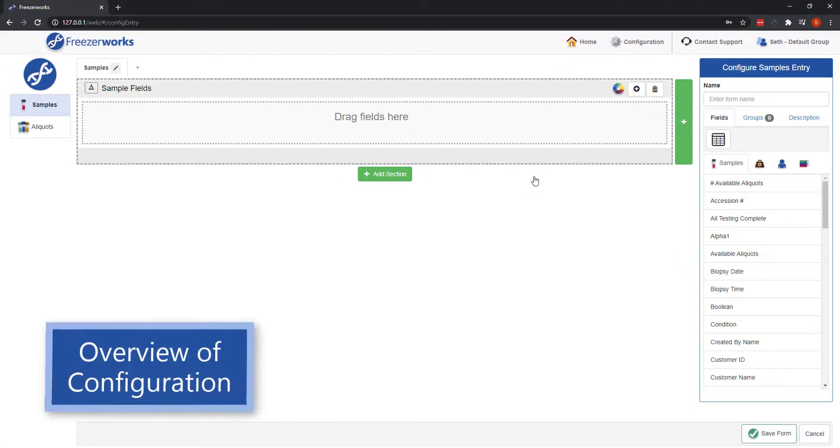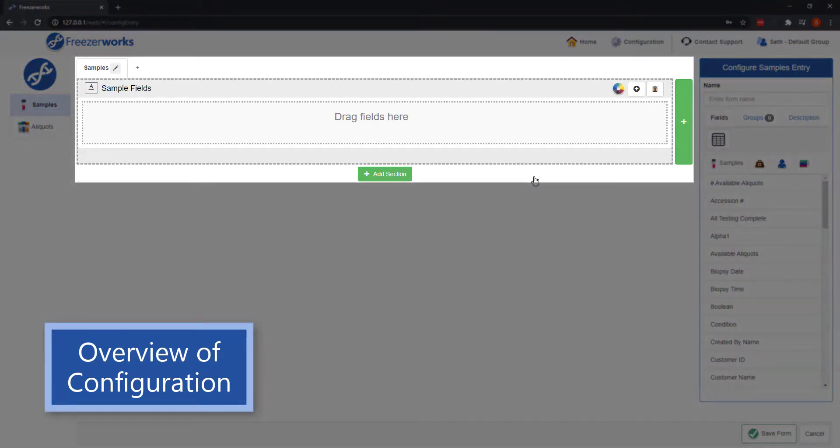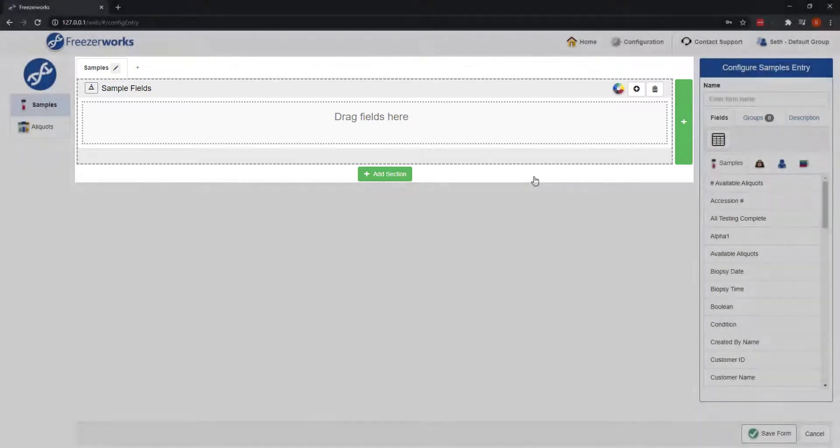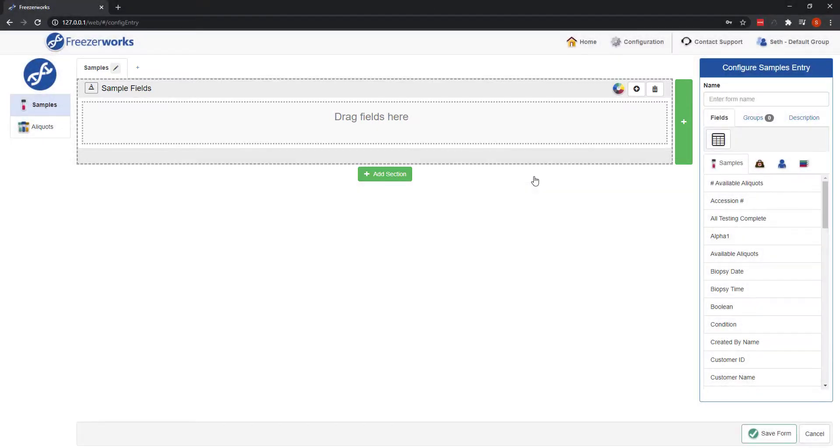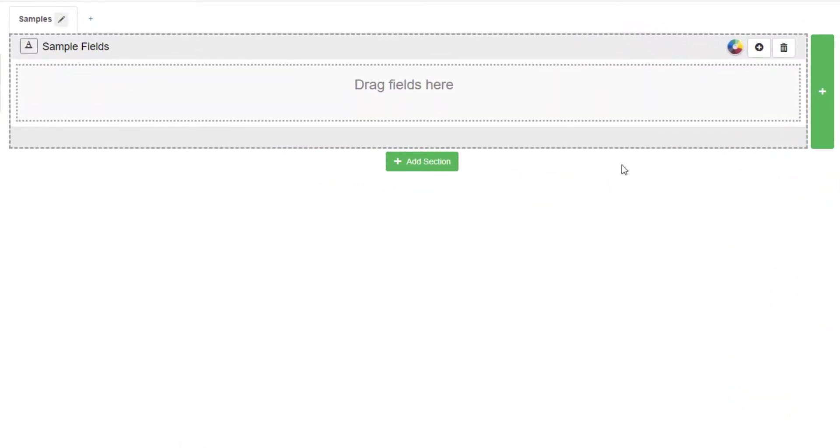And here is a blank samples entry form. Let's quickly go over the anatomy of this screen. The majority of it will be taken up by the entry area, where you will design the space for all the fields you need to add to this form, and where users will enter data for samples when the form is actually used. The entry area is made up of sections, panels, and columns, which will be how you organize and categorize the different fields you add to the form.